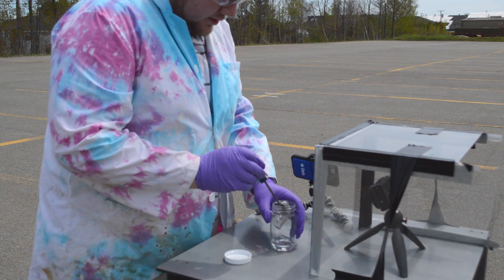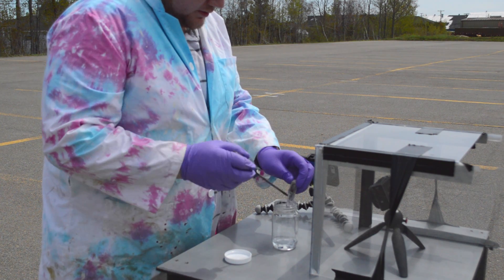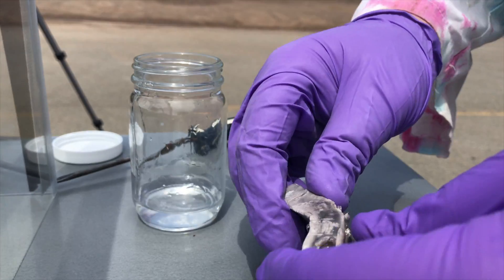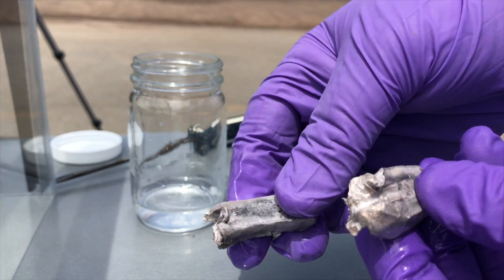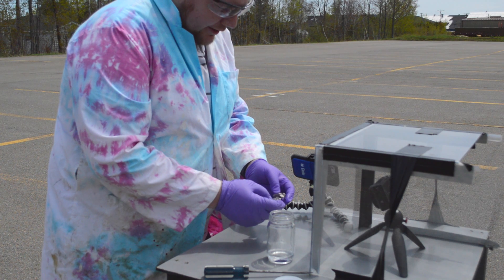Maybe we'll get some flames and hopefully we'll get a cool slow-mo shot of the thing exploding. As you can see, sodium is an extremely malleable element. We're going to take one of these pieces and dump it into a big vat of water.